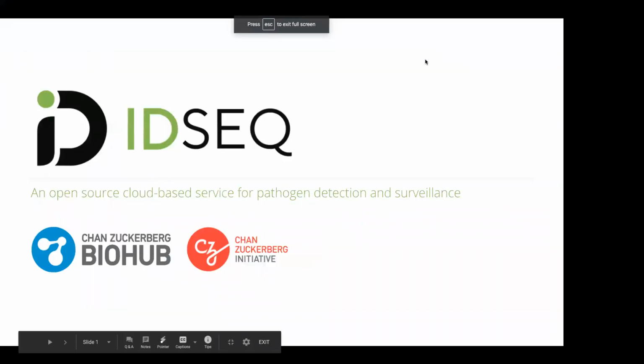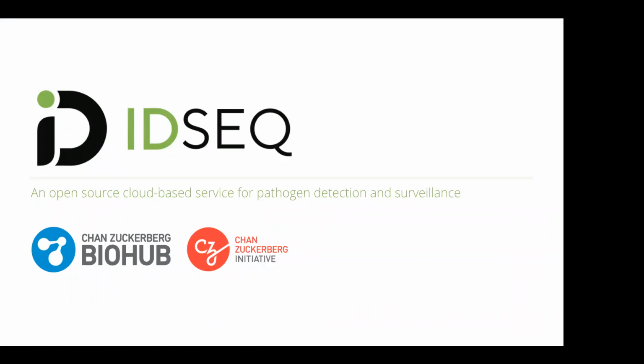All right, so I'm sure that you all know a bit about IDseq since you have made it to this webinar, but I just wanted to go over a little bit about what IDseq is and a little bit of its background. So IDseq is an open source cloud-based service for pathogen detection and surveillance.